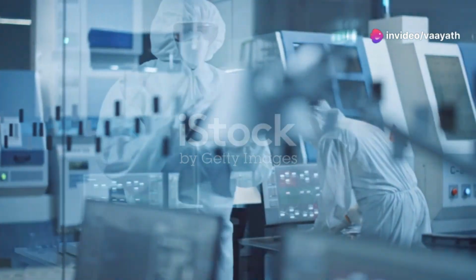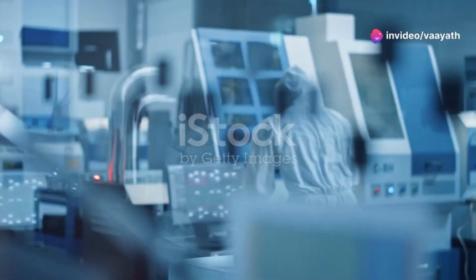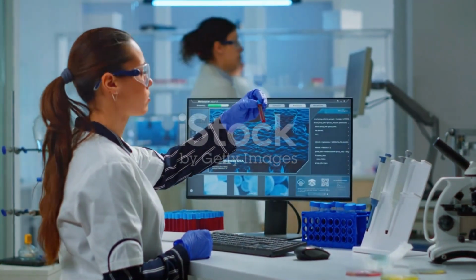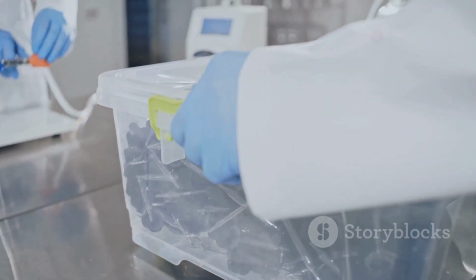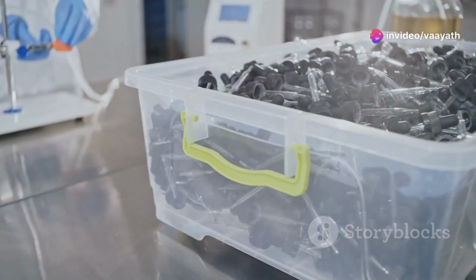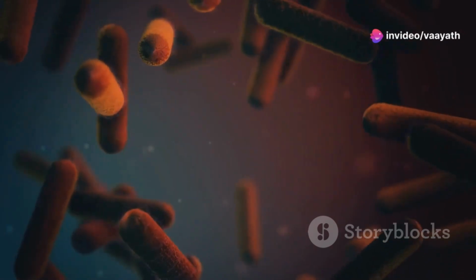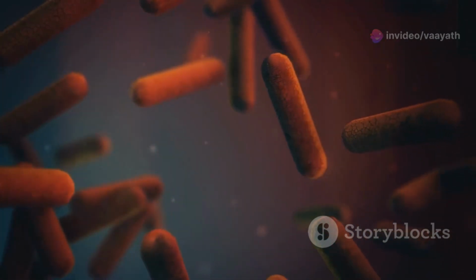Section 7. Evaluating and measuring media fill results. The success of media fill validation hinges on the accurate evaluation and measurement of results. The primary indicator of contamination is turbidity, a cloudiness in the media-filled containers. This cloudiness is a visual cue of microbial growth, indicating a breach in sterility.